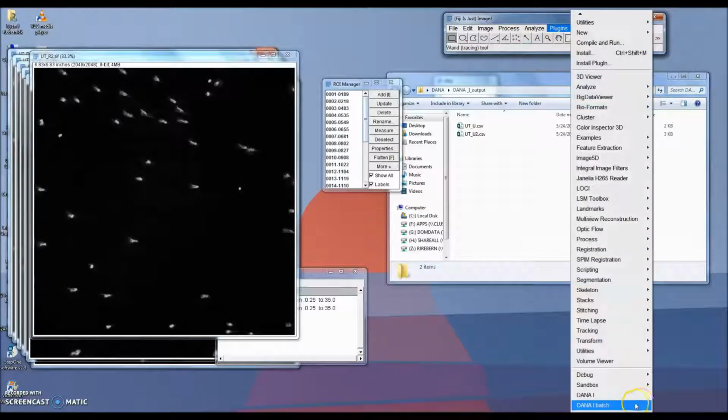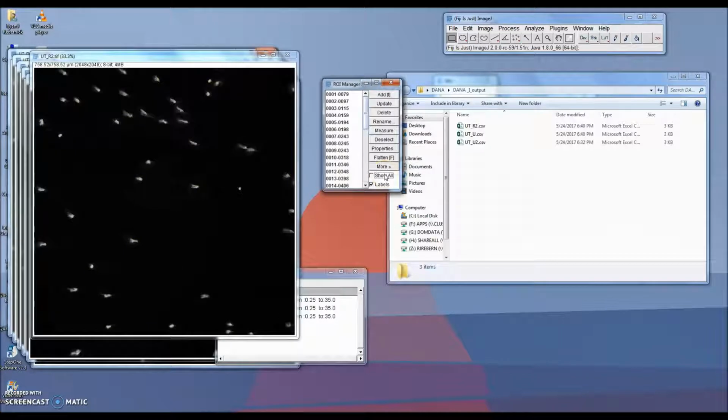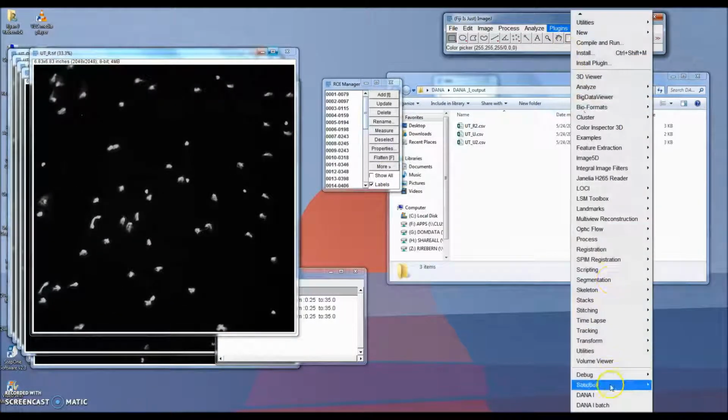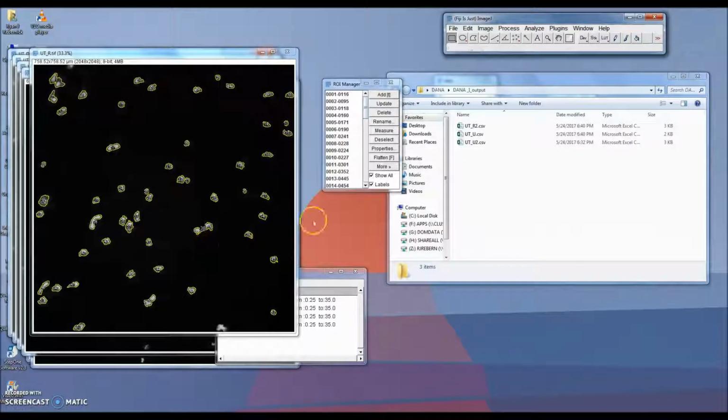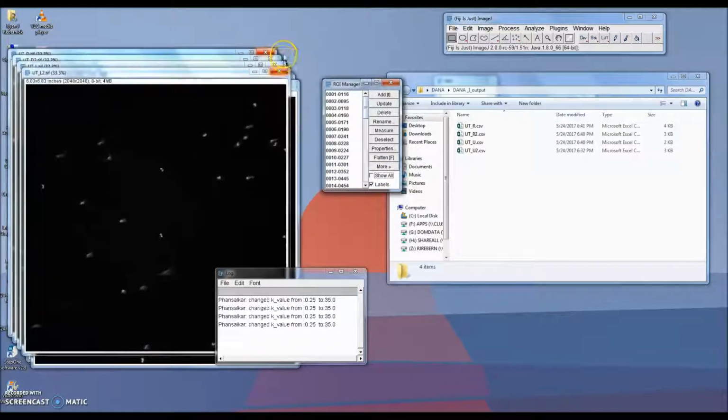I'm going to run on this other image. Okay, that one looks good too. I can toggle on and off to help me see what's what. I see one multiple here, 19, but overall it seems fine. And as you do a lot of these, you get really good at picking out images that contain more than 7 multiples. This one, so 38, that's a multiple right there. 17, that's a multiple right there. 1, that's a multiple up here. So it looks like this is also going to contain less than 7 multiples, so I'll keep it.